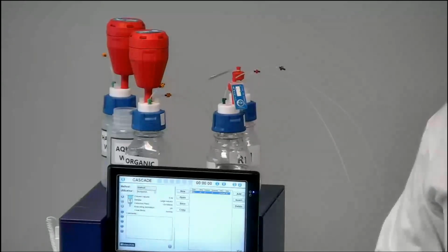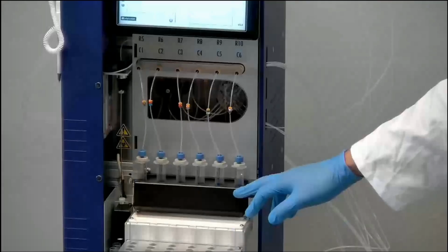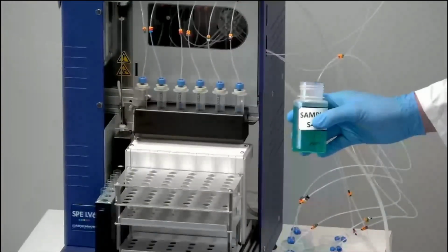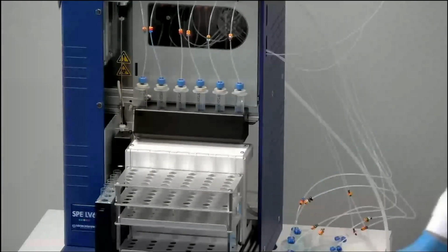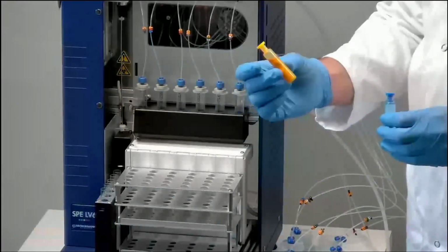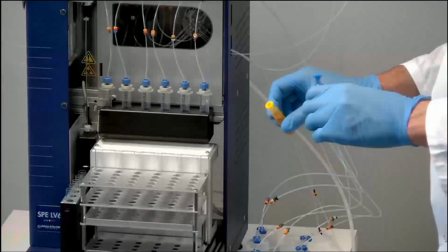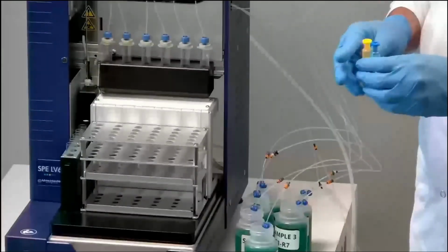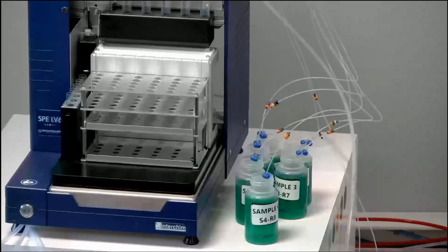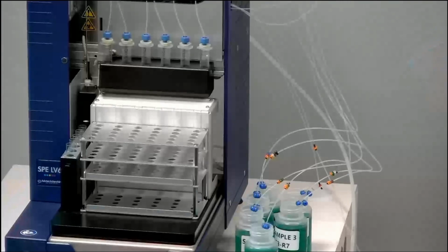So for the purification, here I put 6 columns, 6 mLs, and my goal is to separate. Here I have a sample, for example, it's a green sample, and it's a mix today, just to show you a purification. Here, for example, are my impurities, food colors, and here are my blue colors. I mix 2 drops of different colors to make my sample, and my goal for this purification is to have the blue colors.